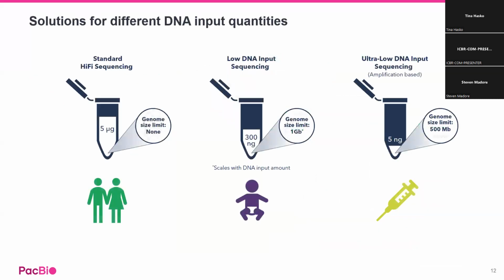Now before going to cancer research in particular, I would like to tell you what PacBio can and cannot do. Are there any samples for cancer research with formalin-fixed samples? And DNA and RNA is heavily truncated on that. And no, we cannot run FFPE-derived samples on PacBio. That wouldn't be good. You cannot use the advantages of long-read sequencing on that.